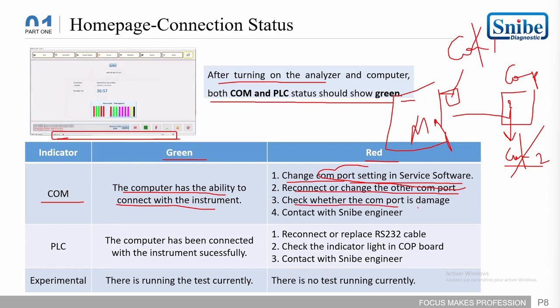Reconnect or change the communication port. Check whether the communication port is damaged, the interface itself of the communication port in the computer, or maybe the cable. Contact the engineer.